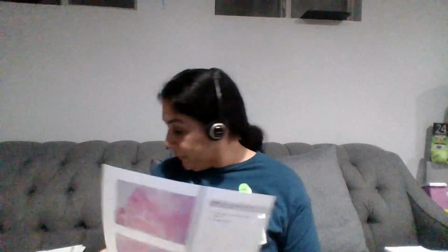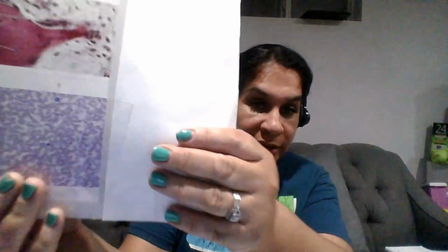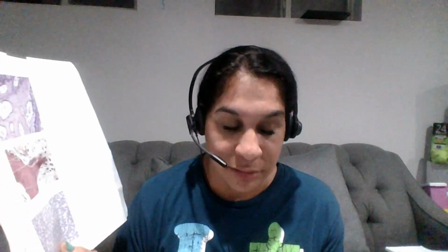So that's adipose tissue. The next connective tissue I picked was blood. This one here is blood, and it has a matrix called plasma. And then red blood cells, which carry oxygen; white blood cells, which destroy pathogens; and platelets, which prevent blood loss.